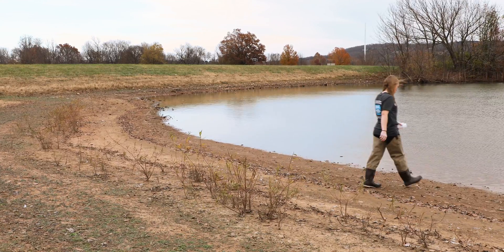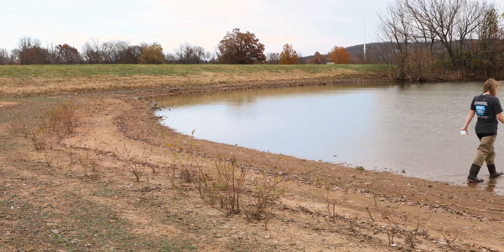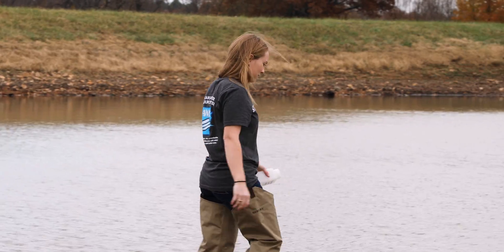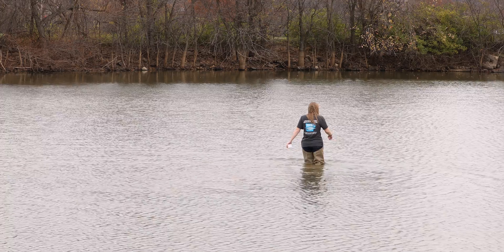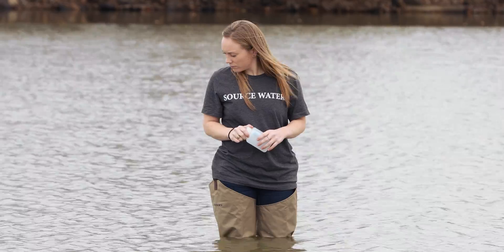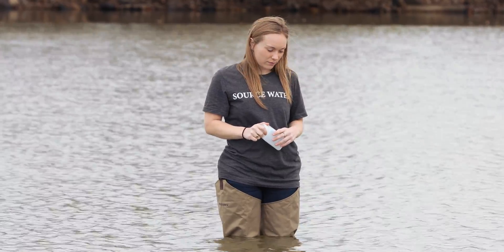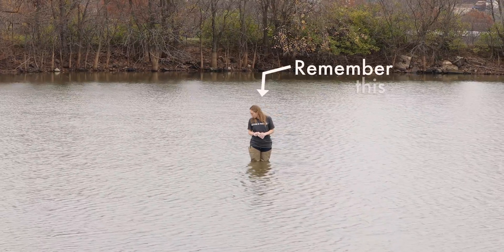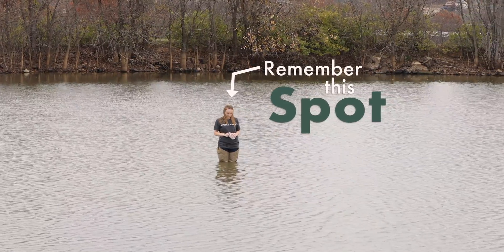With your labeled sample bottle, walk or paddle slowly out into the pond, trying to minimize the amount of mud and sediment you stir up. When you reach your chosen sampling location, wait for any stirred up debris to settle back to the pond bottom. Be sure to remember your selected sampling location for the future. It is best to collect water samples in the same location from year to year so results are comparable.